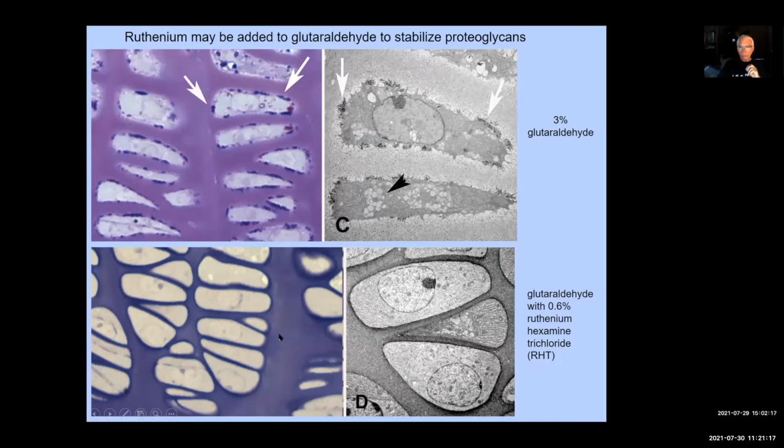Whereas if you preserve the proteoglycan content, proteoglycans are responsible for retaining water in this tissue. If you retain proteoglycans, you'll see an intimate association between the cell border and the, albeit precipitated, proteoglycans. So this is a very important technique which we really like for demonstrating cartilage, especially by light microscopy, also electron microscopy.